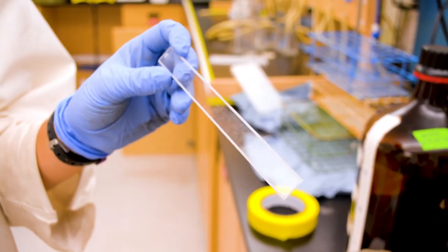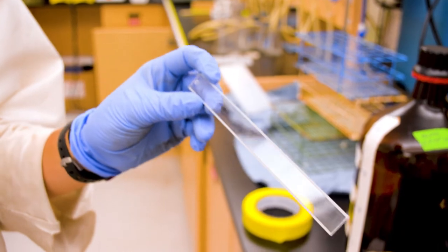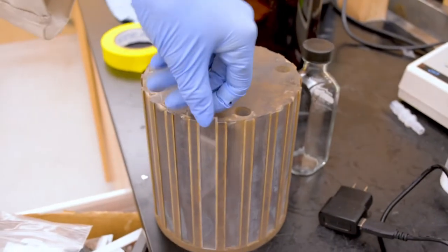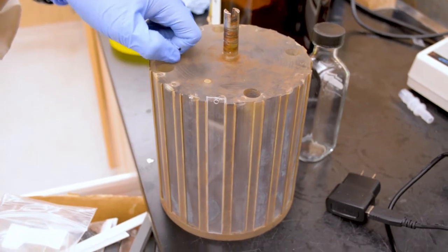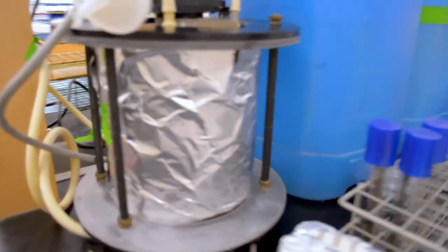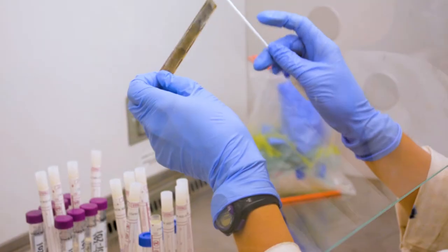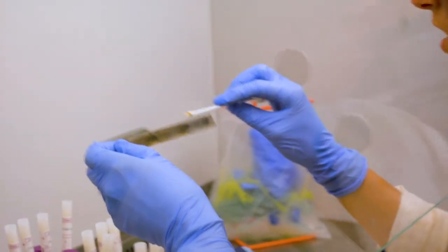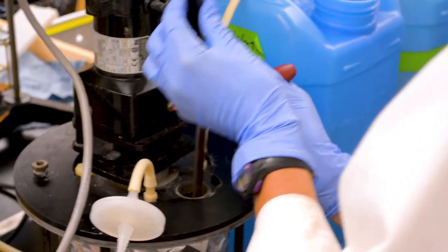We have polycarbonate, we call them coupons. They're just pieces of plastic basically. On one side they've been coated with the graphene coating and they slide into the reactor. Then as the reactor spins, biofilm attaches to it. That's the surface that we swab to remove the biofilm to perform tests.